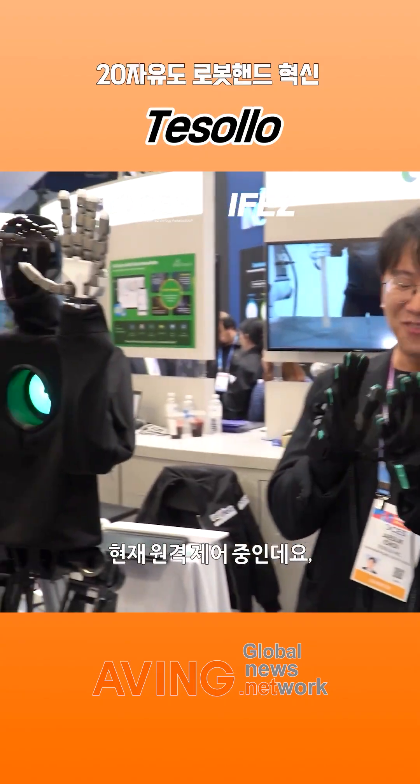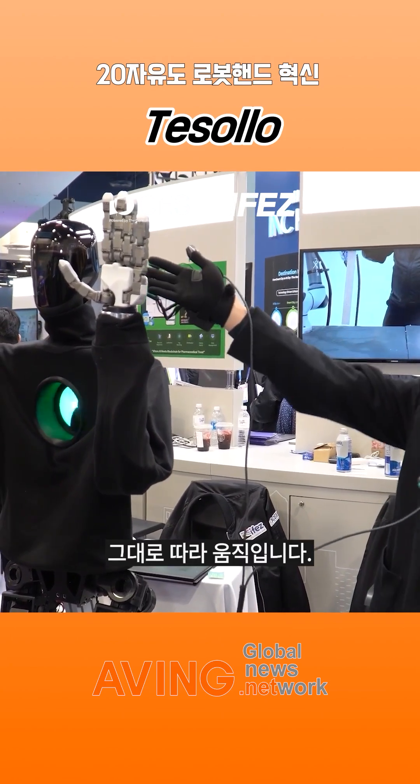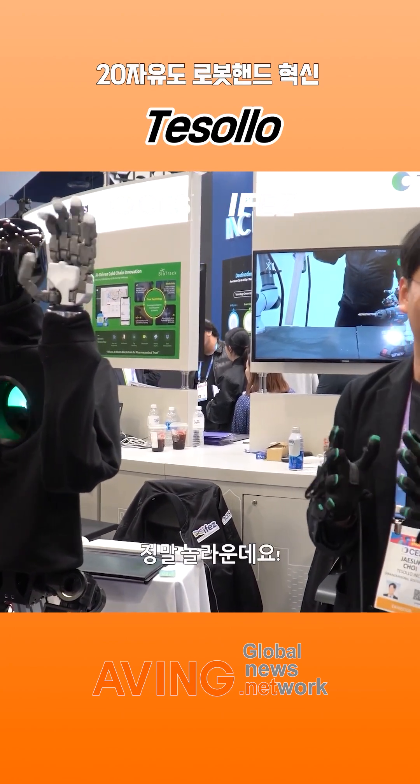Wow, what is this? It's that we are now doing teleoperation with my hand with our robotic gripper. Wow, this looks insane!